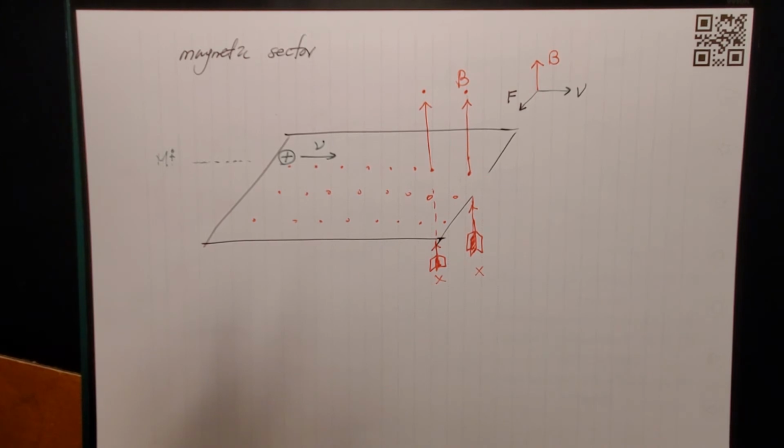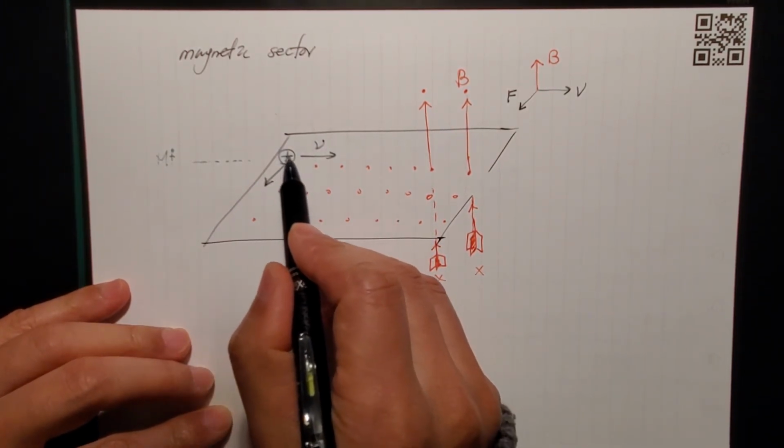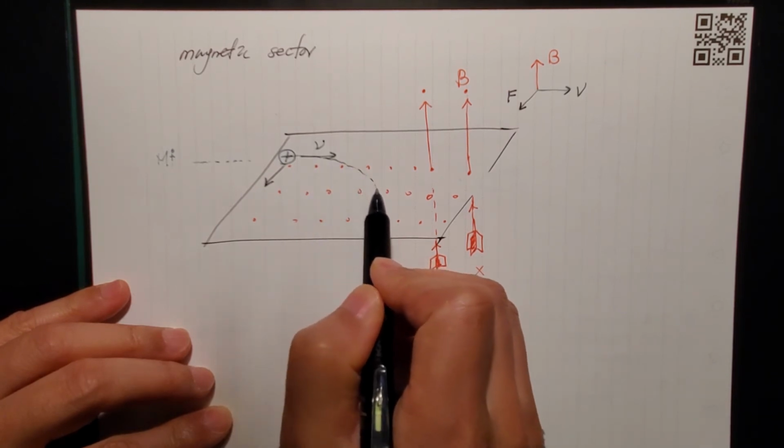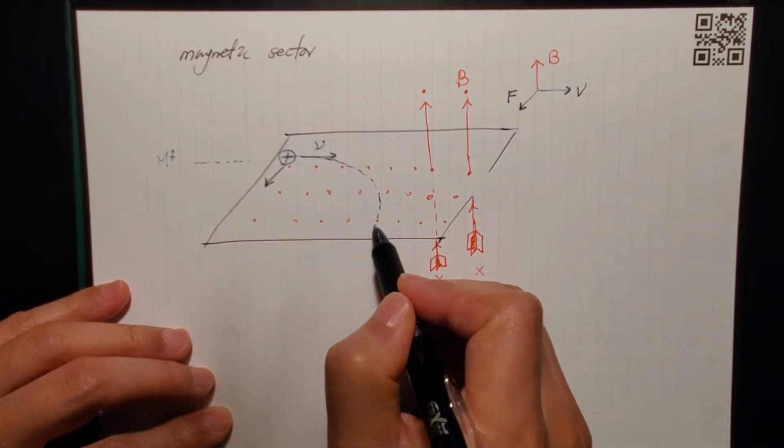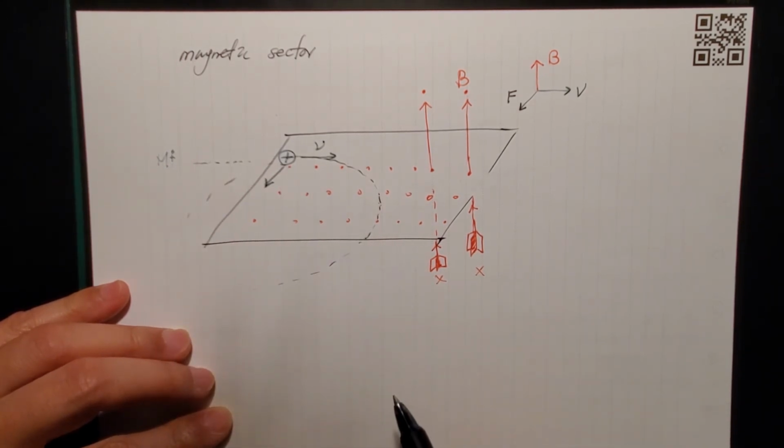Then you know what happened. When only a one-time force is given, it just changes the angle and that's it. But if it keeps being given, then it makes a circular motion. So the F is what makes this charge curve and eventually go in a full circle, right?